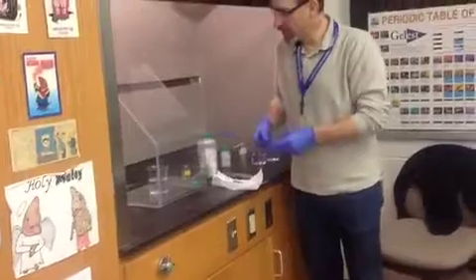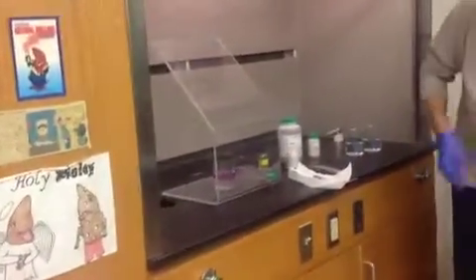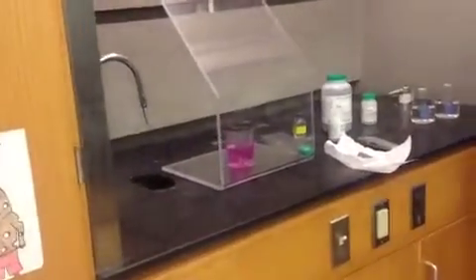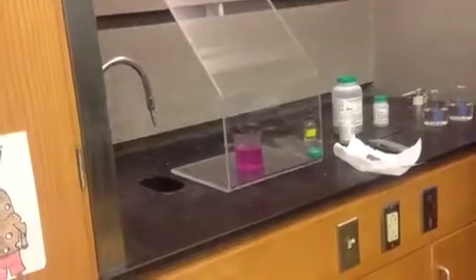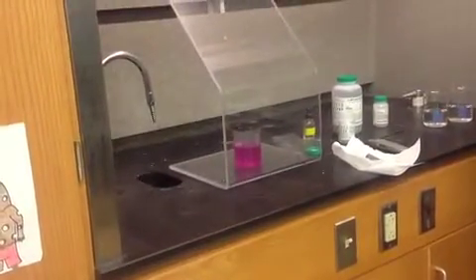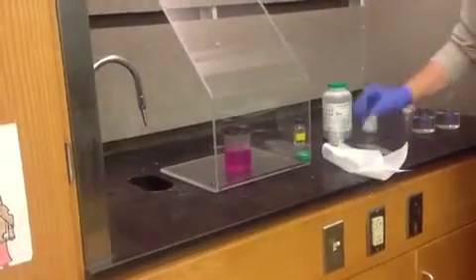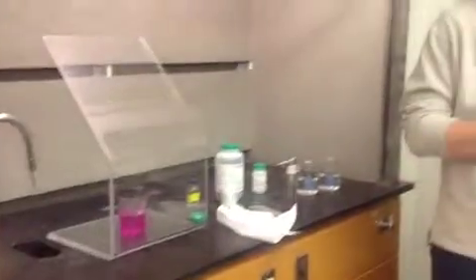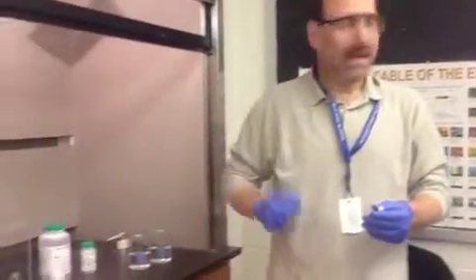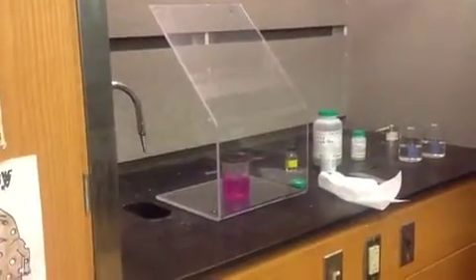So we put the lithium in here, and it's going to kind of bubble and fizz and move around a little bit. What's coming off is hydrogen gas, and it's making a thing called lithium hydroxide, which is turning the water pink. It's going to react with the water. Now, the lithium itself, as the metal, has the 3 electrons that lithium comes with. The water is taking that 1 electron off and making it into the lithium ion.